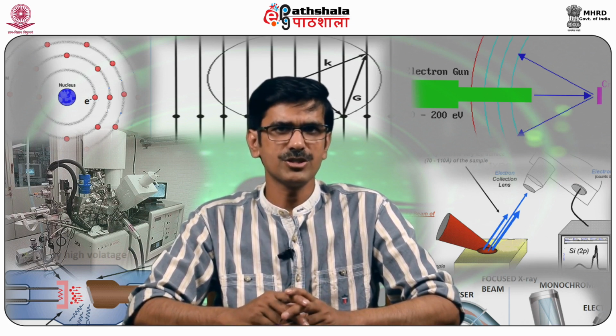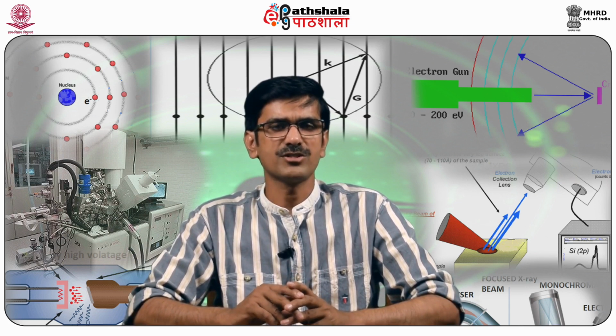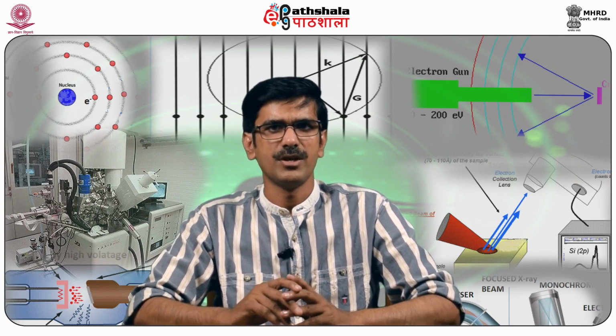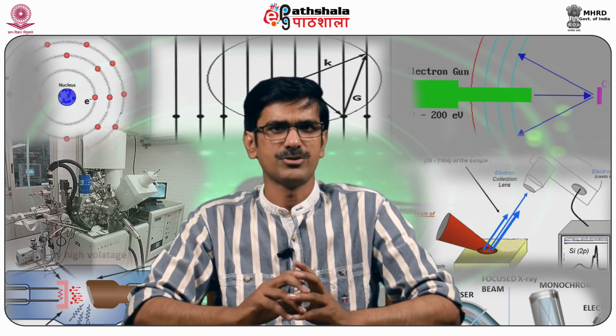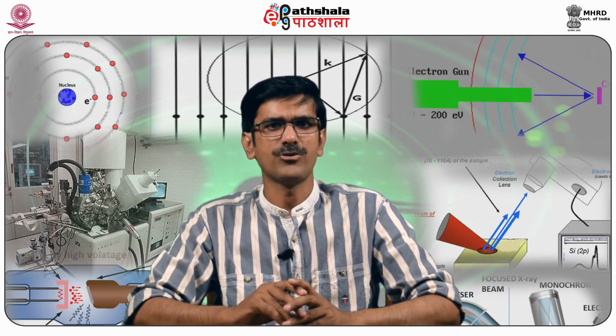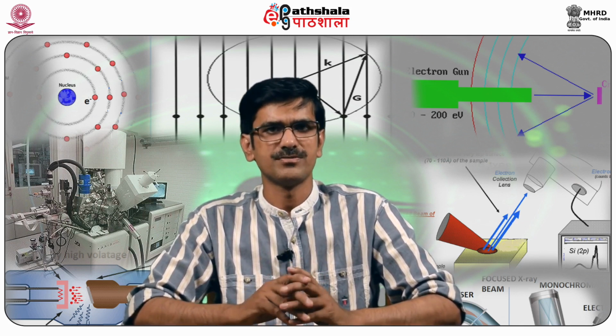The major distinguishing feature of a SDD is the transversal field generated by a series of ring electrodes that causes charge carriers to drift to a small collection electrode. The drift concept of SDD allows significantly higher count rates coupled with a very low capacitance of the detector.